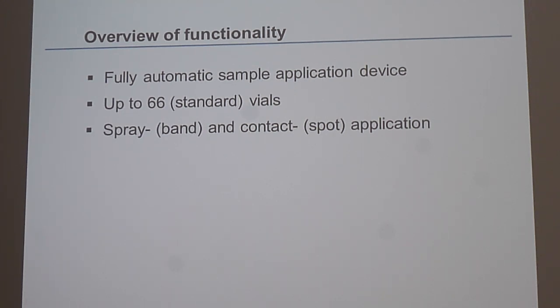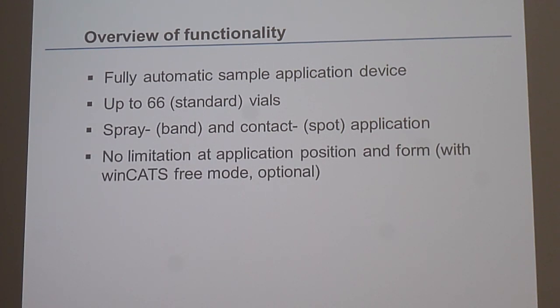What is better? Because if you have a spray application with a dot, yes, it looks like you have a small flag on the side. That means you have a small part which looks like a flag on the plate, and gives you not a very nice view of the application.